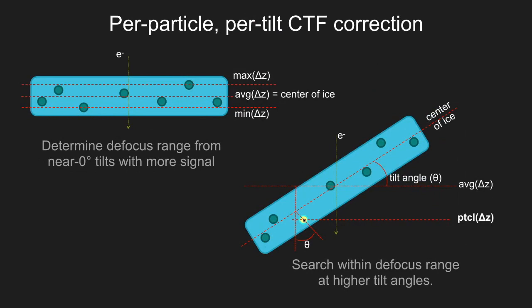So in the original EMClarity paper, there was one other example. There was actually a publication showing how some of these sorts of corrections could move the subtomogram average, in the case of the HIV envelope protein, which is a very specialized case. It's not exactly in situ, where you could move that down to about 3.2 angstrom resolution using the subtomogram averaging technique.